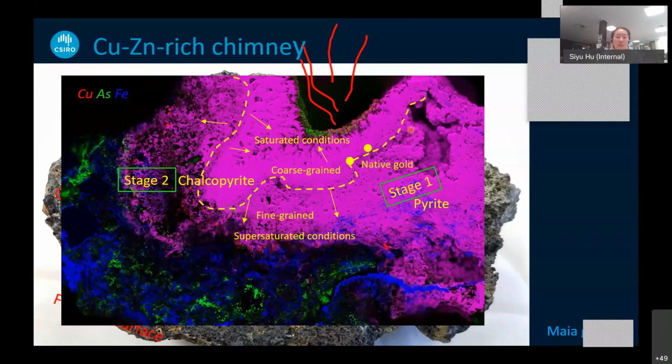And also we can see the boundaries between the coarse grain and fine grain studies. I want to zoom in on the image here, but within the time limit I will just tell you that we also did a similar study at the thin section scale of these samples, and we found these boundaries are enriched in sphalerite, micro-scale native gold and some pyrite, and that represents the primary wall and the initial fluid mixing that happened here. So from this simple map, we can get a lot of information from the hand specimen with the naked eye.